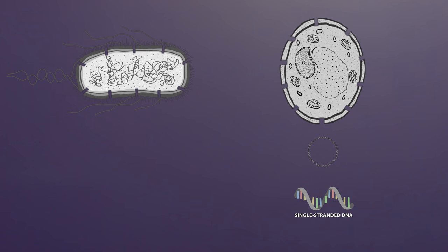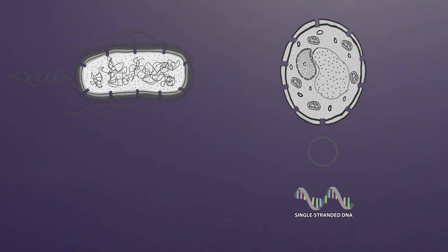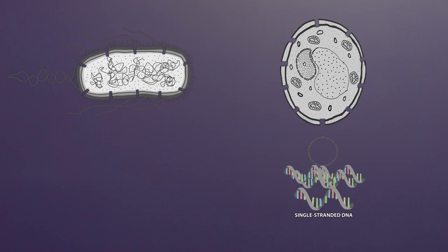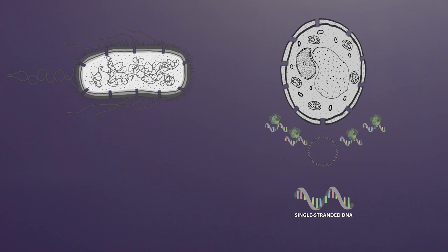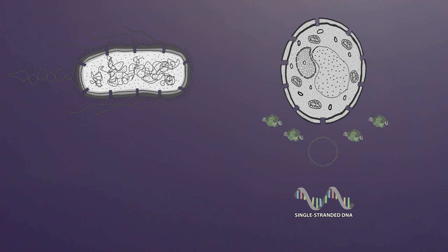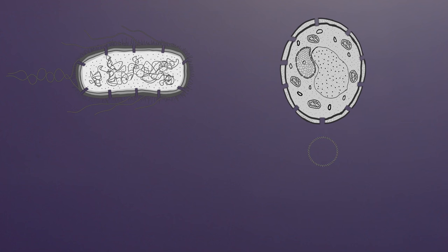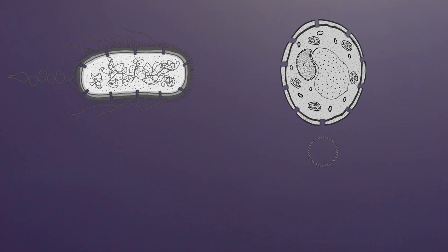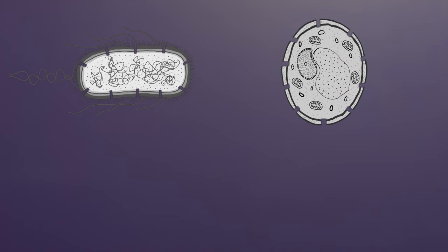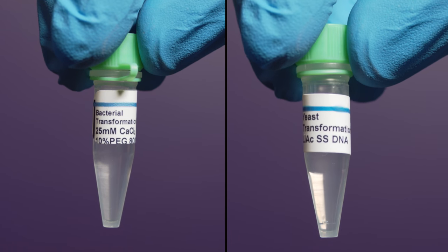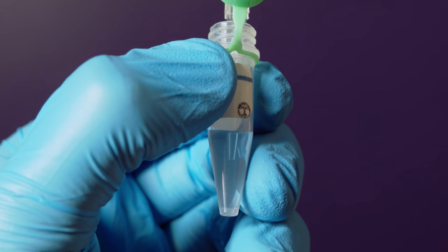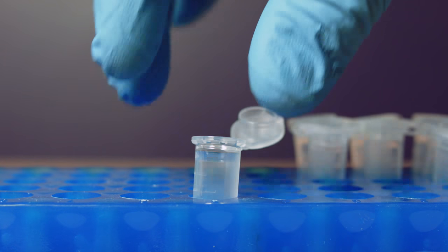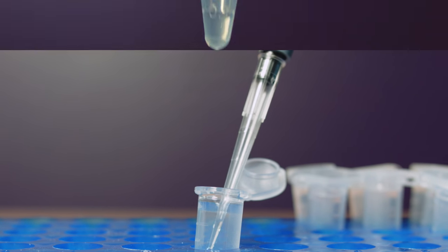The single-stranded DNA in the yeast experiment isn't performing any modifications. Instead, it's used to overwhelm the cell's defenses so the nucleases are more likely to digest them rather than the plasmid DNA that has the coding for the green fluorescent protein. For both the E. coli and yeast transformation mixes, pipette out 100 microliters of each and add it into a new microcentrifuge tube, one for each. Discard the tip.